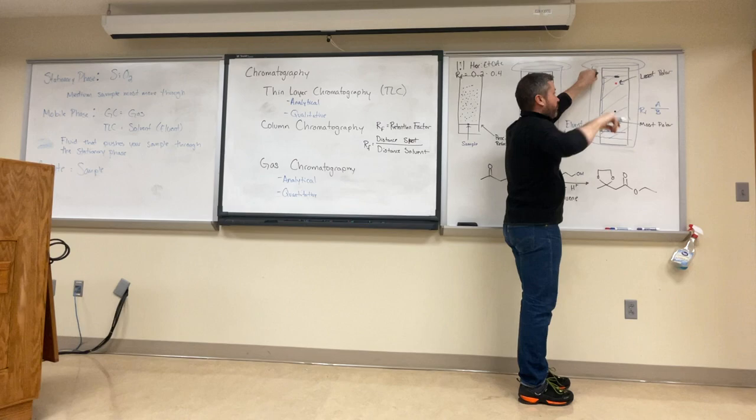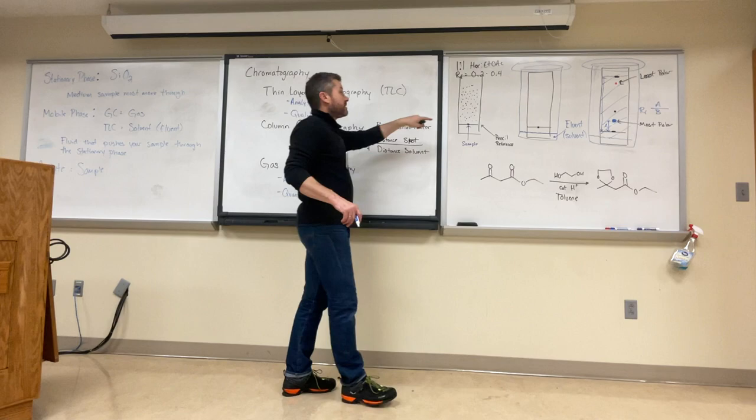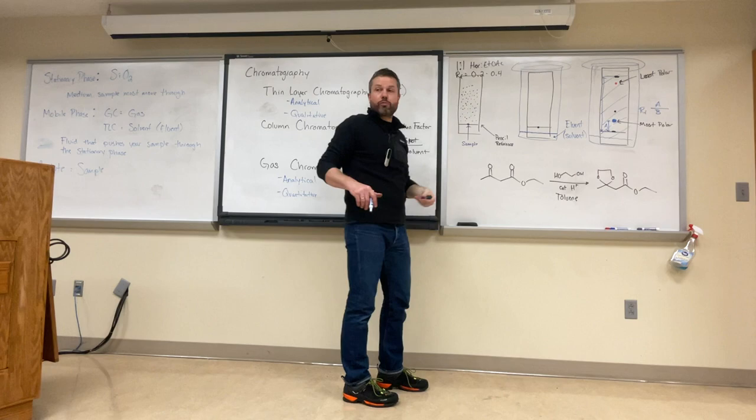So you're going to be looking to find a solvent system that gives you an Rf for our product spot of 0.2 to 0.4. All right, and I'll show you which is our product spot once you run your first TLC. Questions so far?